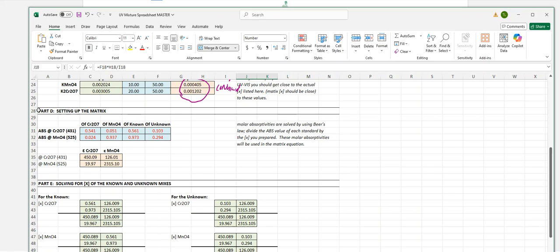That then sets us up for part D. And part D now is what to do with all the math. What to do with all the UV data. And in that video, we'll discuss it, but that video is going to happen next.